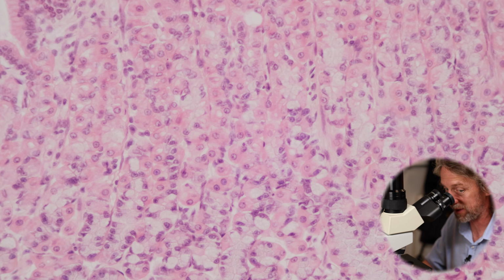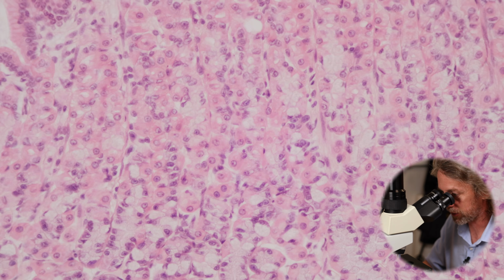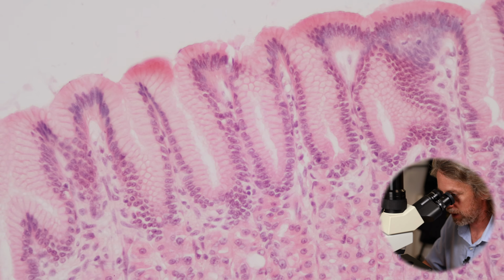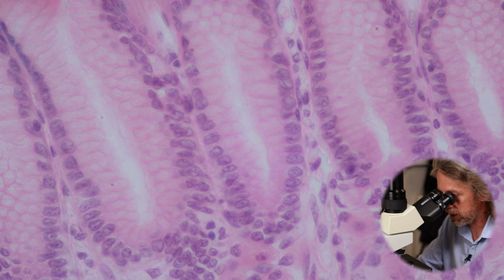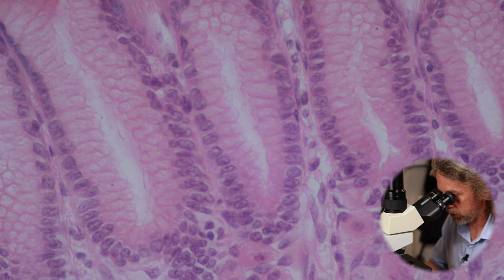You can see that the cells down here look quite different to the cells up here. So these cells have got one job, mostly producing mucus, and the cells down here have got a different job, producing things to help with digestion. How's that? Because that's quite a hard thing to understand, that's quite a hard thing to describe. All right, let's jump up to the 40 times objective. So 400 times magnification for me. It's got a little bit soft. What can I do?